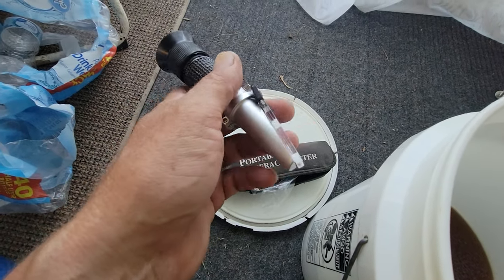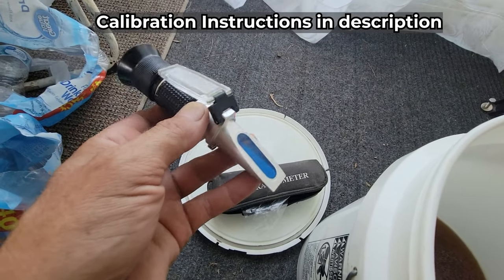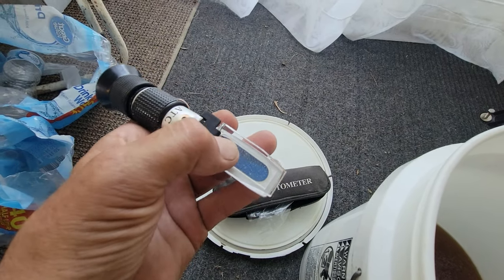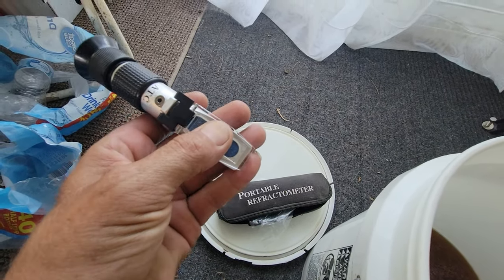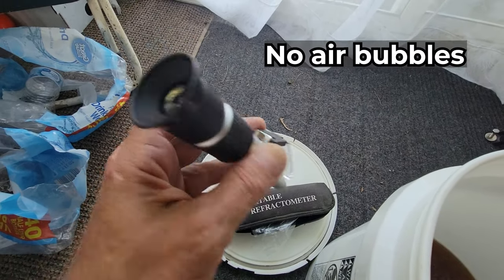And the way it works is you calibrate it with olive oil. After it's been calibrated, you then put a drop of honey on that blue screen and you put this flap down and smash it against the honey. And you want to make sure that it covers this whole surface area. And then you can look through the refractometer and you can get a reading on it.